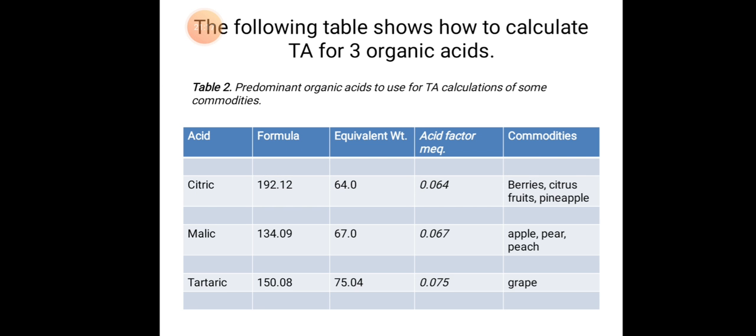So these are the different quality determination tests done for fresh commodities like fruits and vegetables.